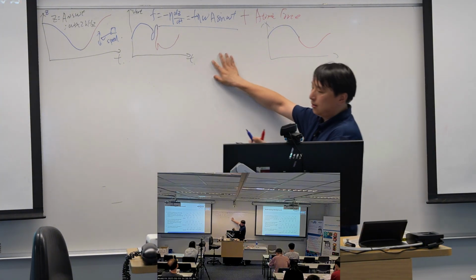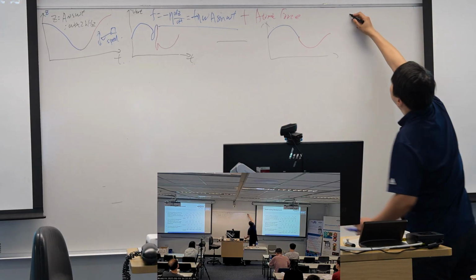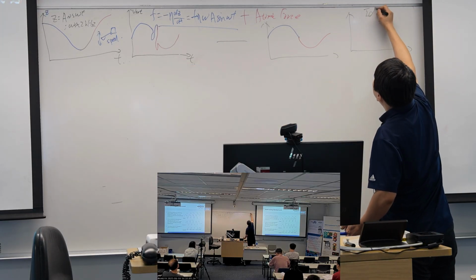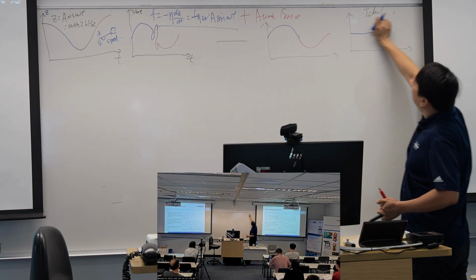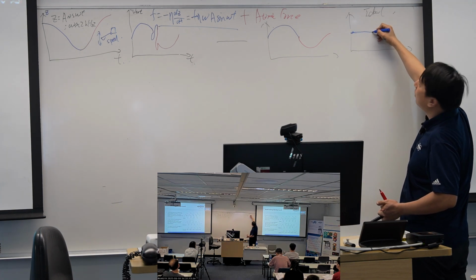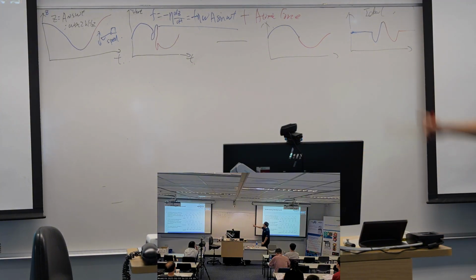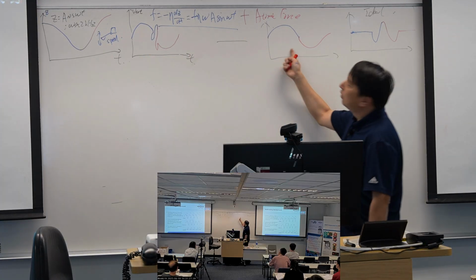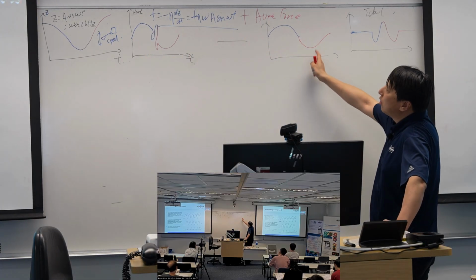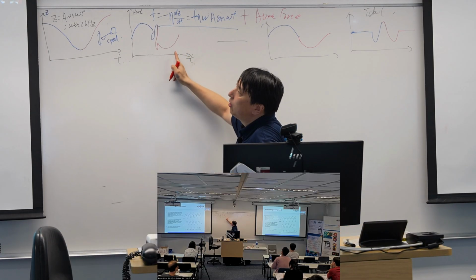If we can subtract the hydrodynamic force from the force we captured, we get our ideal force curve, a completely plain background. That's the ideal force curve we want to get. So how do we do it? We need to subtract the background from our vertical value.